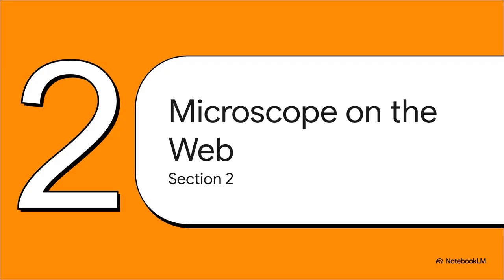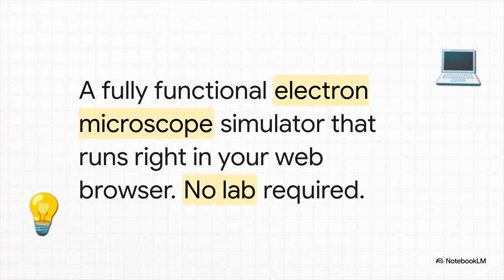What if you could take a multi-million-dollar microscope and put it on a laptop? Well, this is it. An absolutely ingenious solution. Researchers created a fully functional, real-time electron microscope simulator that runs right in your browser. No lab, no multi-million-dollar price tag. You just open a tab and you're in.